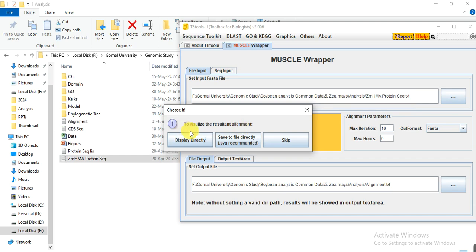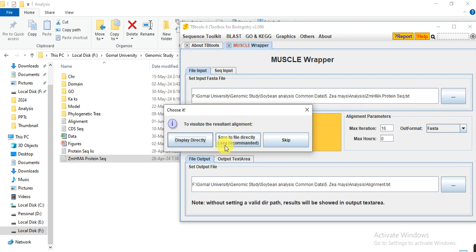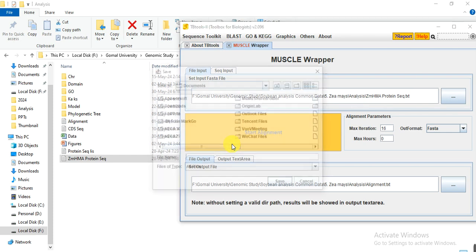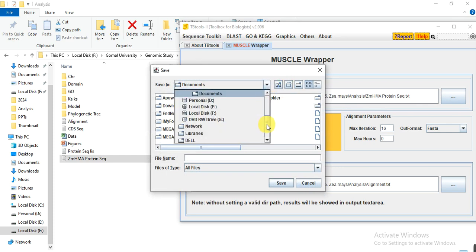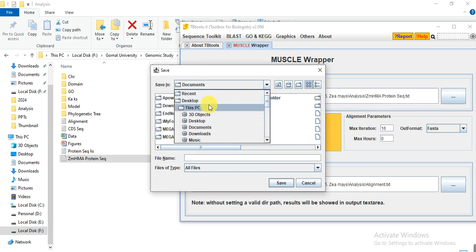After starting the alignment, a message appears asking where you want to visualize the resultant alignment, that picture where the alignment appears in colorful form. SVG file is recommended, so it will ask you about the path where you want to save that.